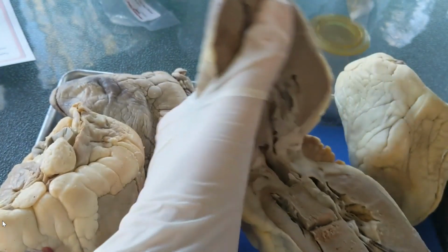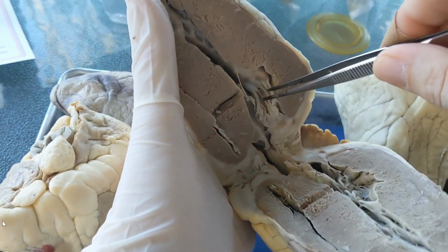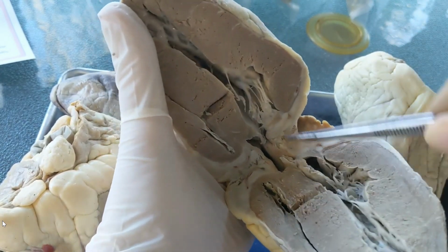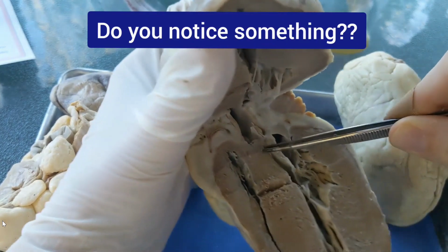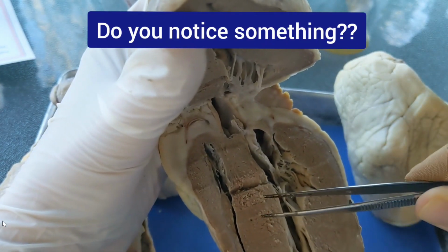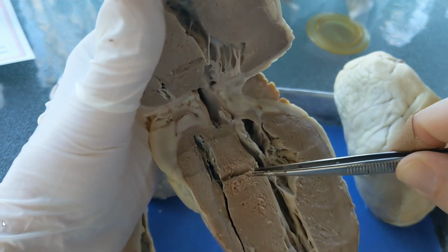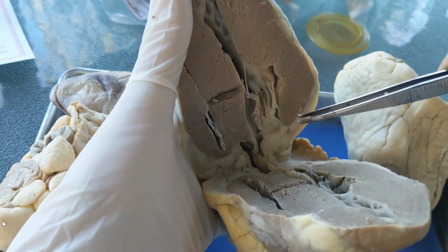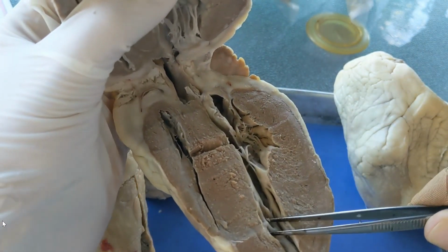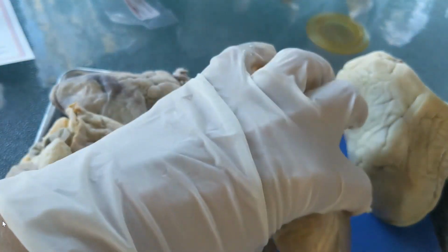So the hearts have already been bisected. Look at each valve. Check out the septum. See if you notice any problems in the septum. And if you do, you need to note whether they're between the ventricles or between the atria, because there are septum abnormalities both between ventricles and between atria. Okay, so that is cardiac case C.